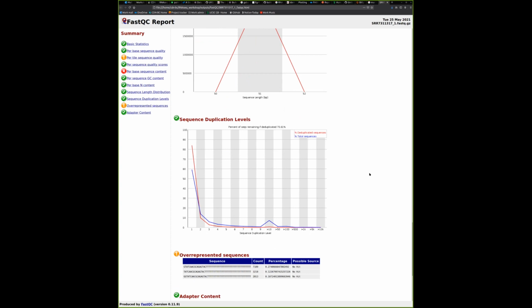So you usually run a couple of PCR reactions and sample RNAs or cDNAs from there, and you do expect some degree of duplication. This is very common. This is not due to PCR entirely. This is also due to repeated sequences in your genome and your transcriptome. All of these SINE elements, repeat elements, and RNA sequences are very abundant. So you do see a certain peak around this, more than 10 times duplication.